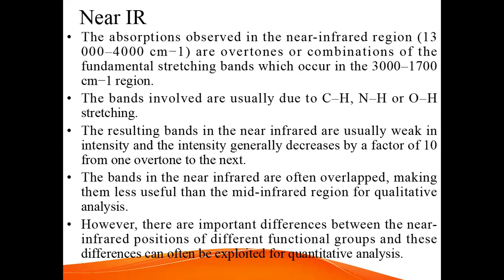The bands in the near-infrared are often overlapped, making them less useful than the mid-infrared region for qualitative analysis. However, there are important differences between the near-infrared positions of different functional groups, and these differences can often be exploited for quantitative analysis.